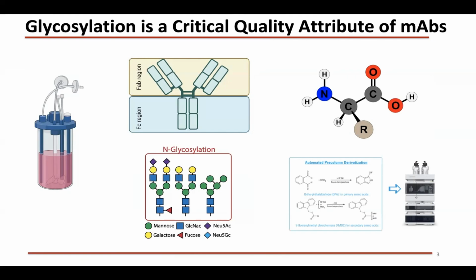spent media composition analysis is done on automated HPLC workflows, as shown in the bottom right over here, using some of these standard labeling chemistries with HPLC workflows from many of the industry vendors.